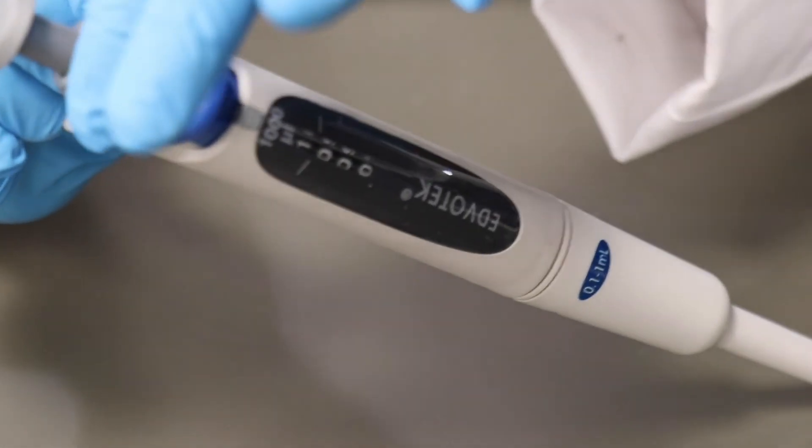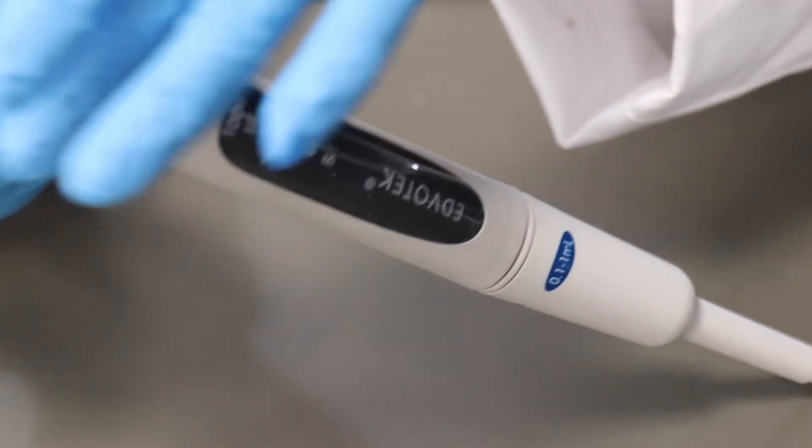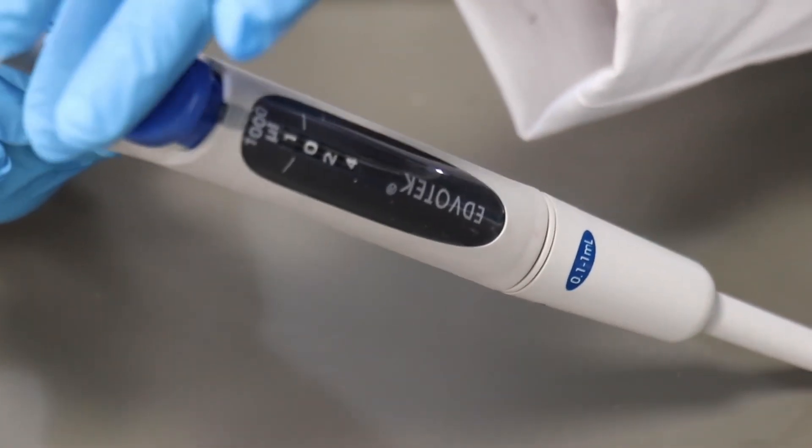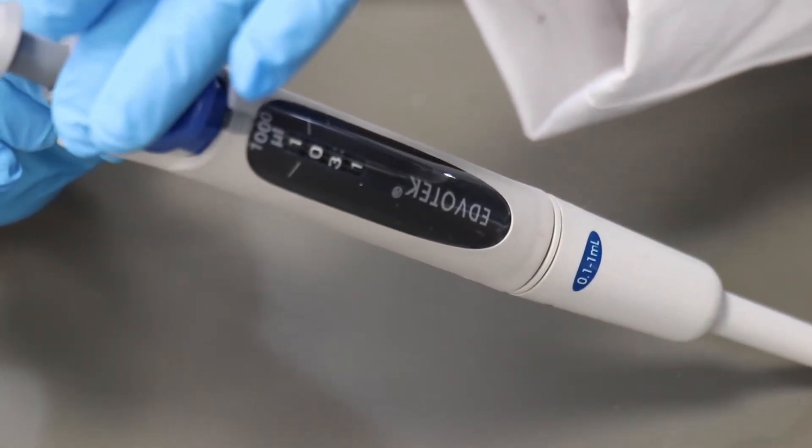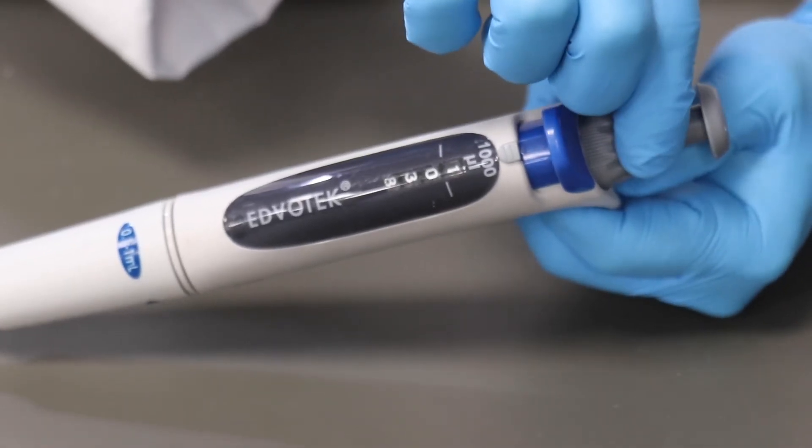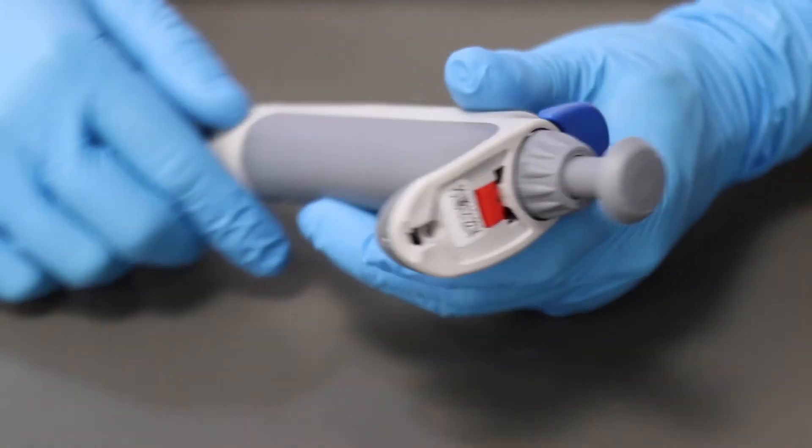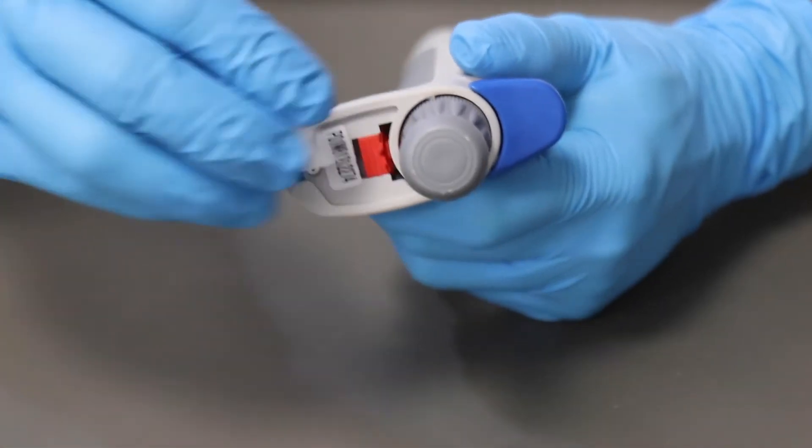While continuing to hold the red tab, turn the dial until the readout on the micropipet matches the actual measured weight displayed on the balance. Once this value has been set, push down on the dial to its original position and release the red tab to lock it into place.